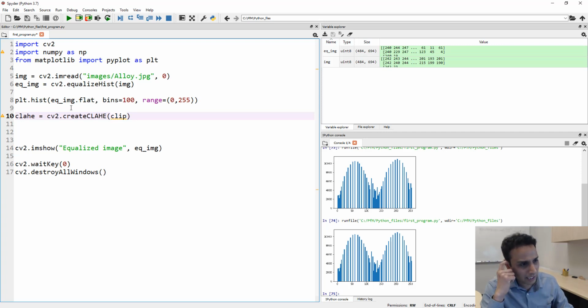I'm cheating here on the other screen. I have documentation about it. Go ahead and look at it. I always mess up the uppercase and lowercase, so I always have the documentation to see what the parameters are that go into this specific function. Otherwise, it's a waste of time. So clip limit, and let's just do 2.0. Again, look at the documentation of what that value means. And this is more important for now: grid size, uppercase S, I believe, equals, and let's just do an 8x8 grid.